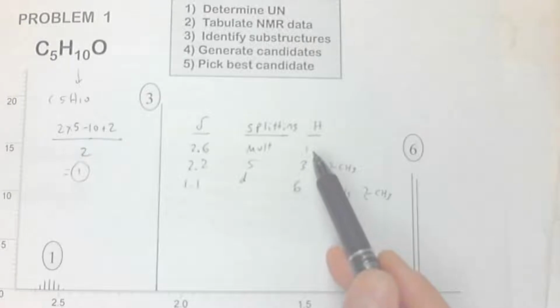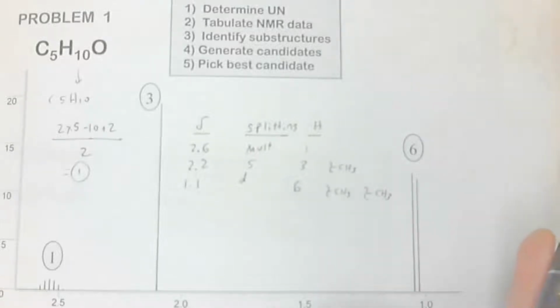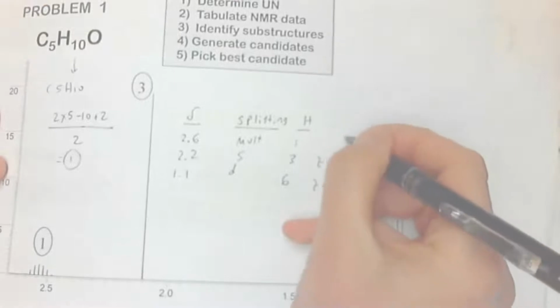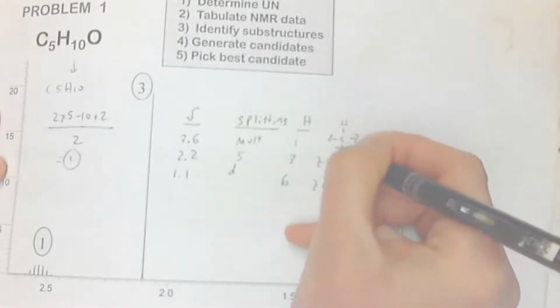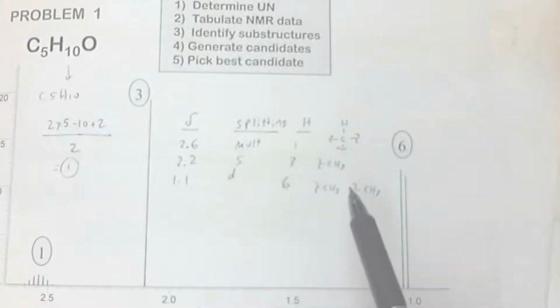It's obviously 1 hydrogen, maybe a CH. And how many squigglies did we determine are on a CH? 3. So it's a CH with 3 squigglies. Cool. All right. We're almost there. It looks still daunting, right? How are we going to turn this into a chemical structure?